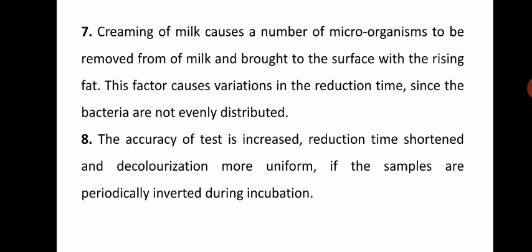So this is the basic information regarding the MBRT test. In the next lecture we are going to study another test, the resazurin reduction test.